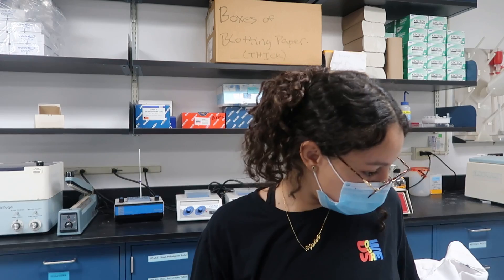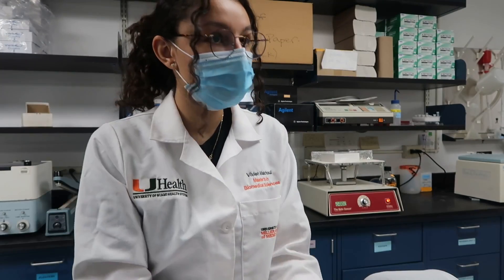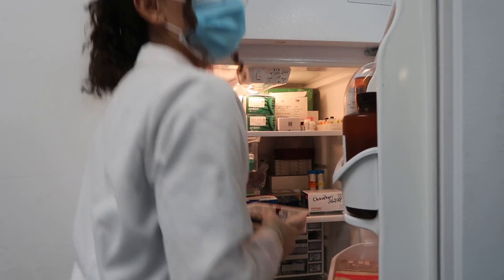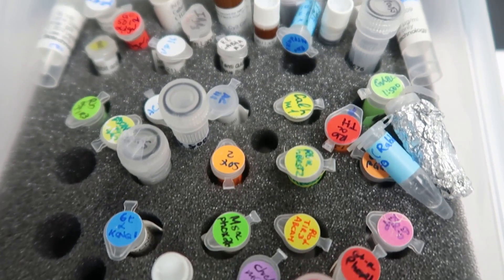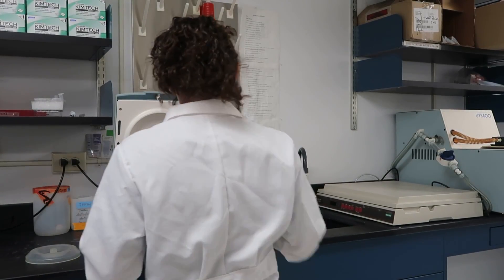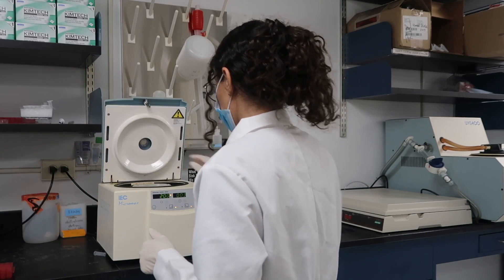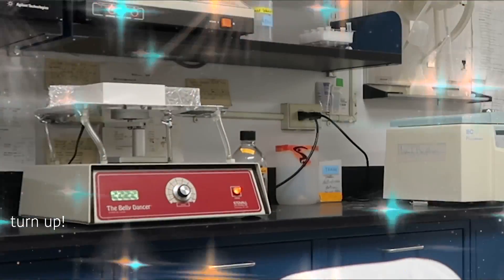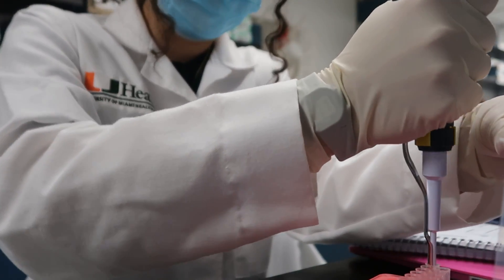My lab mate took the marker because he's using it, but it's cool — like a sticker or something. 30 minutes until primary antibody needs to bake, so let's go. I love when they're easy to find. So I'm staring at myself later like, where's the timer sitting? I don't see it. Now time for primary antibodies. YOLO.